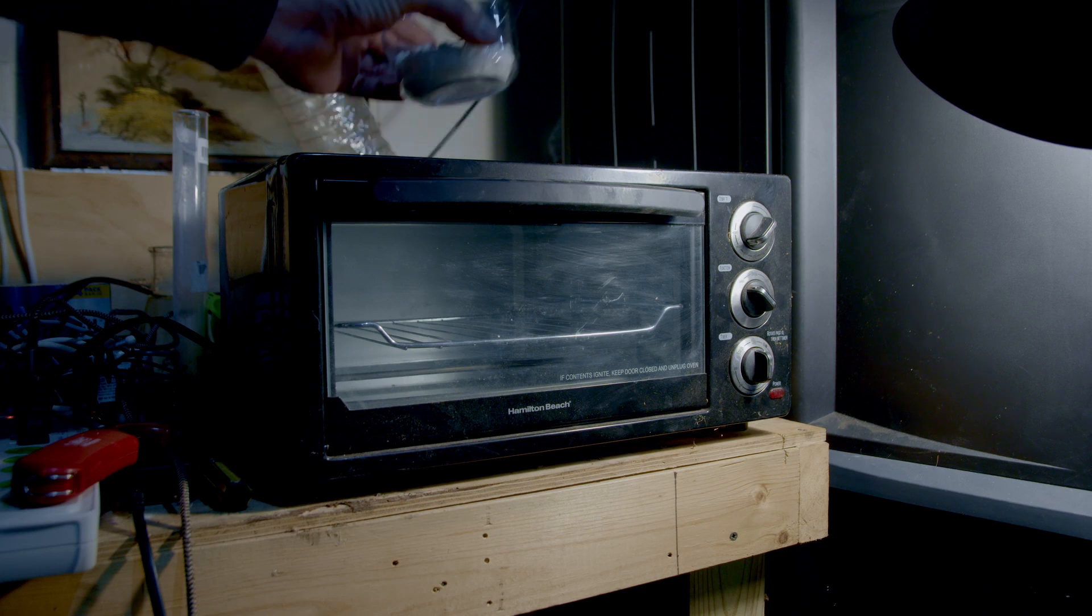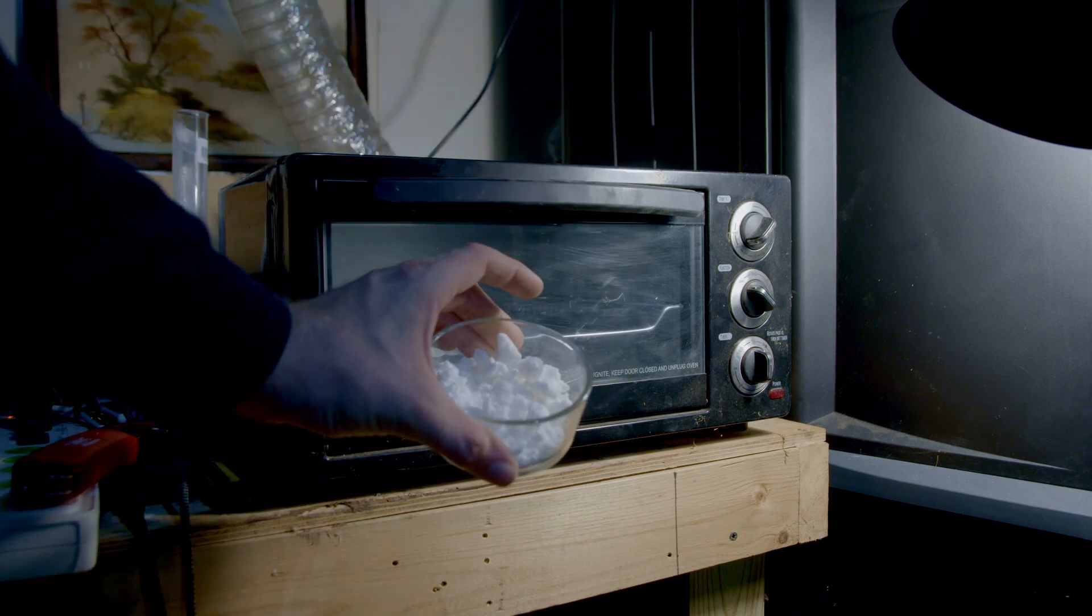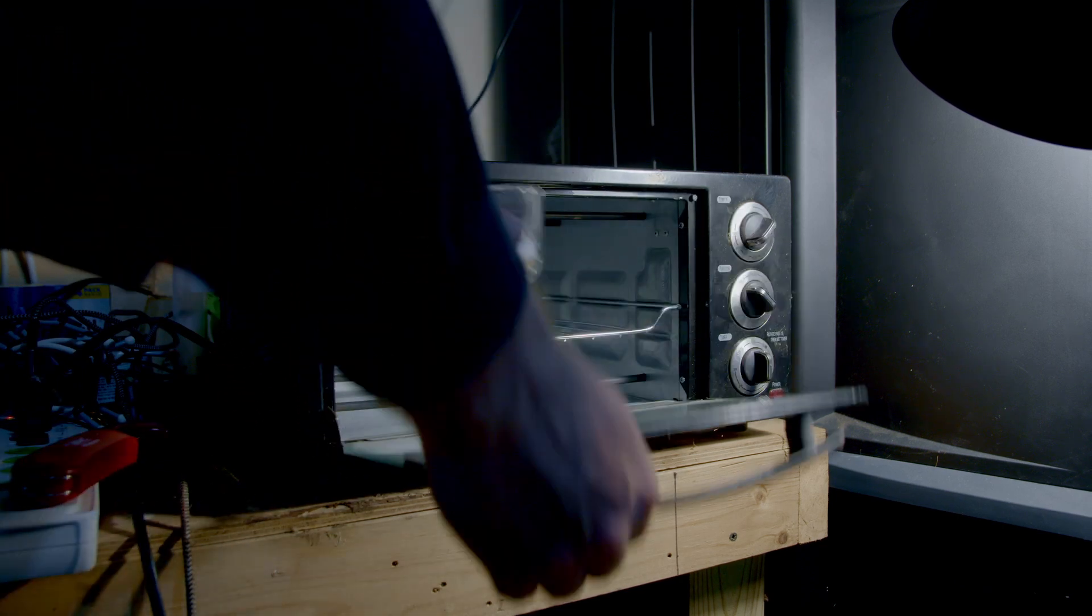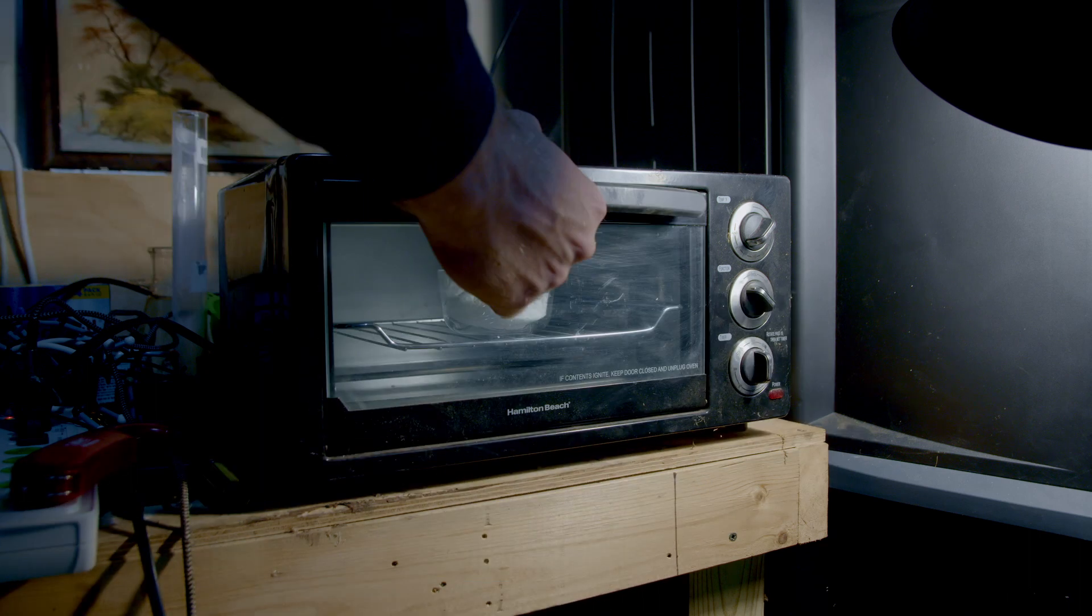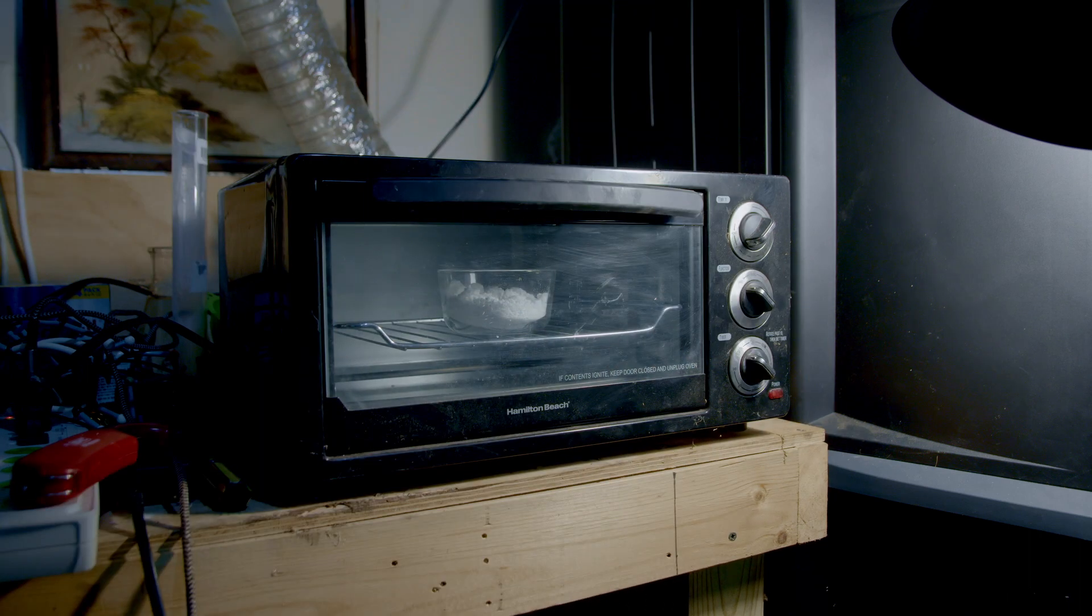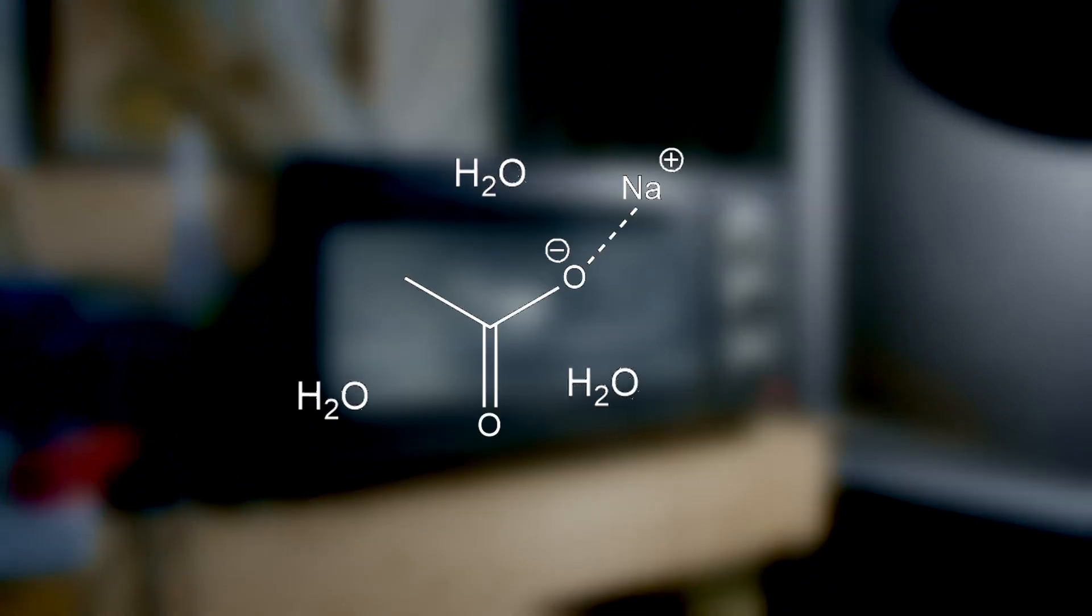And from there we add the sodium acetate crystals to a little dish and we heat them for several hours at 300 degrees. We do this because the sodium acetate actually holds onto water in a form called sodium acetate trihydrate. If we heat it up for long enough we can drive the water off.